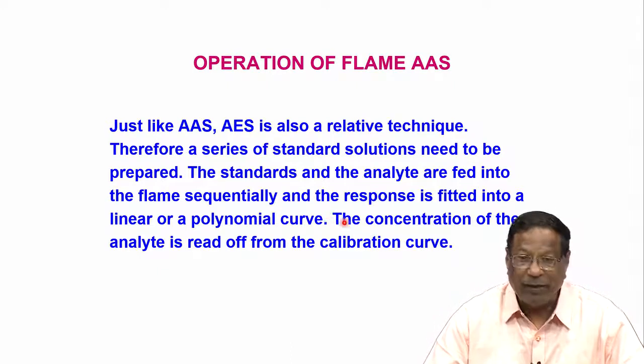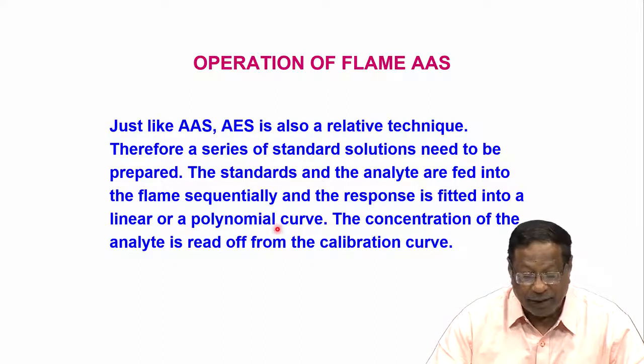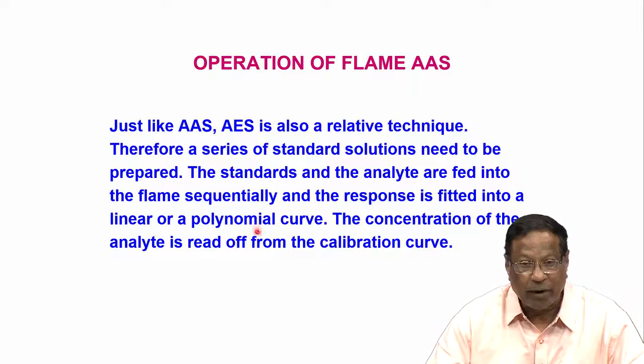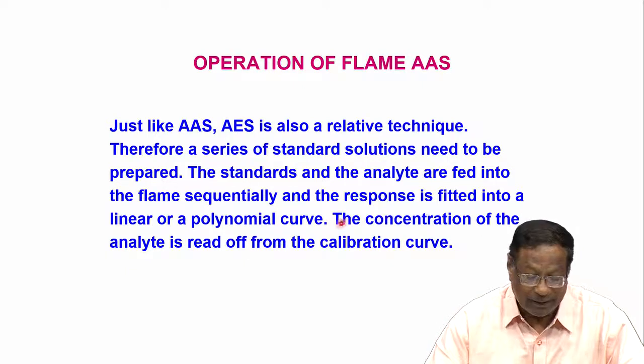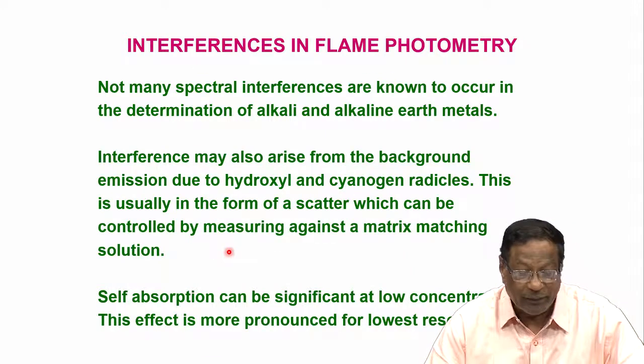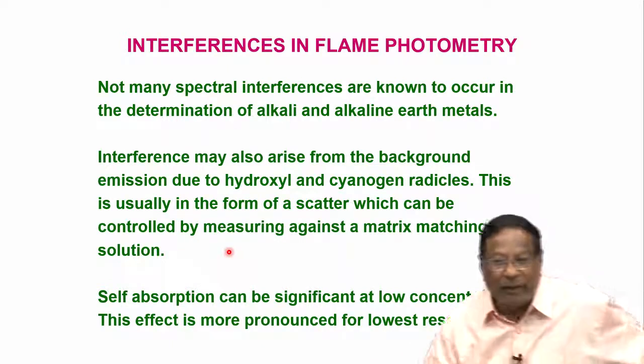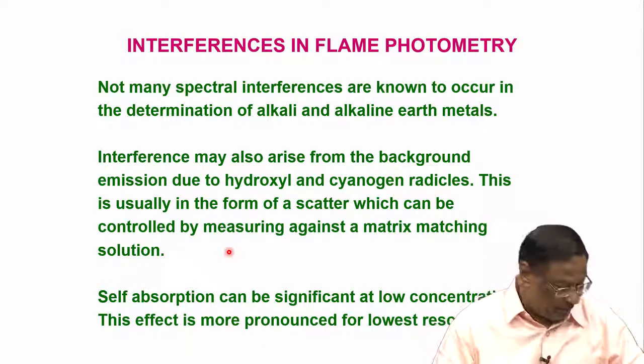But one has to be a little careful, especially when you are preparing a calibration curve. You should either refer to the text or standard text and see what kind of response is expected for each element. So, the concentration of the element is read off from the calibration curve, that is important. So, are there no interferences or interferences? We come to the other part.